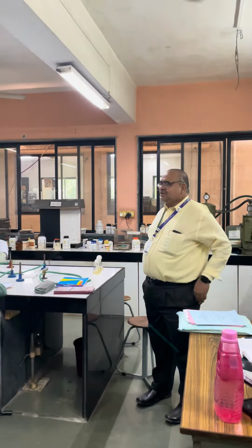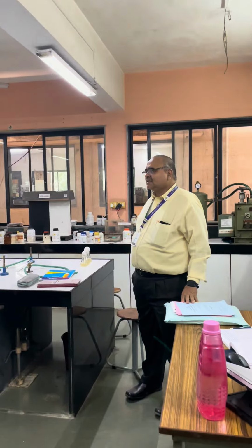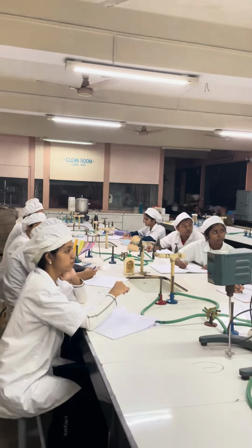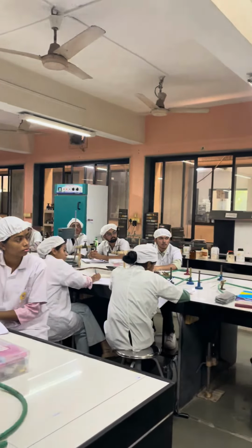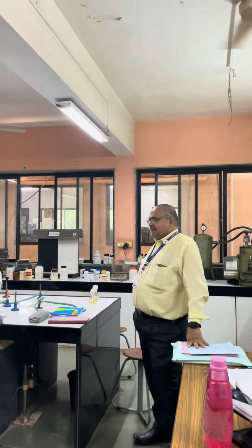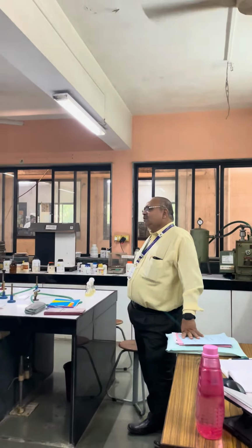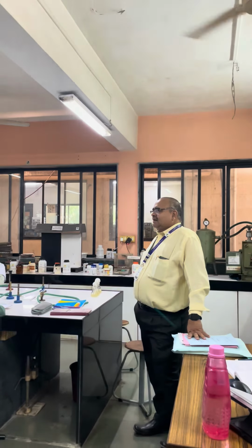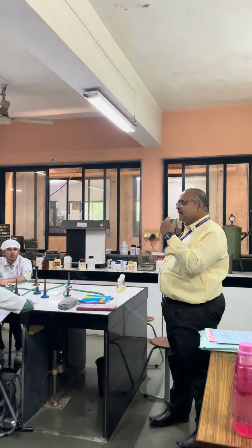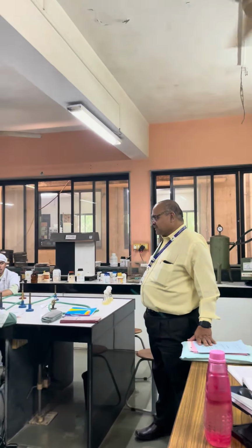See here, when you add the blue litmus paper to the test tubes, when the blue litmus paper turns red, what does it indicate? Please answer. Acid production is there. You have added the Durham's tubes in the inverted position in the sterilized lactose fermentation broth. Those tubes are without bubbles. So if during incubation, after addition of water, bubbles are observed in the test tubes, what conclusion will you draw? Gas is produced. When the red color is developed, it indicates acid production, and when a gas bubble enters the inverted Durham's tube, you get the indication of gas production, right?